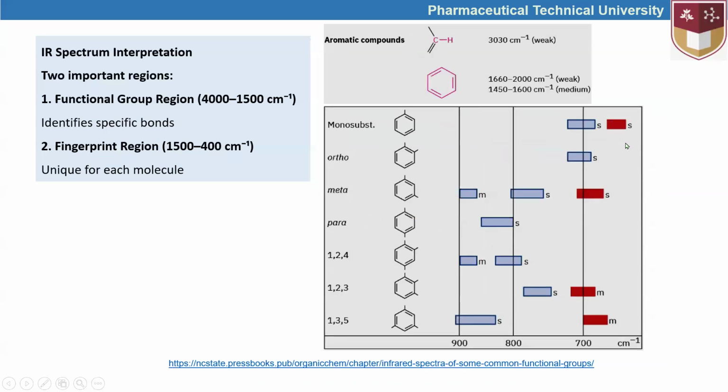And this is another example in aromatic compounds. In aromatic compounds, if we have a monosubstituted compound, it has a wave number around 700 or somewhere like 640, 650, yeah. And the addition of another functional group causes the formation of di-substituted derivatives in ortho, meta, and para conditions.